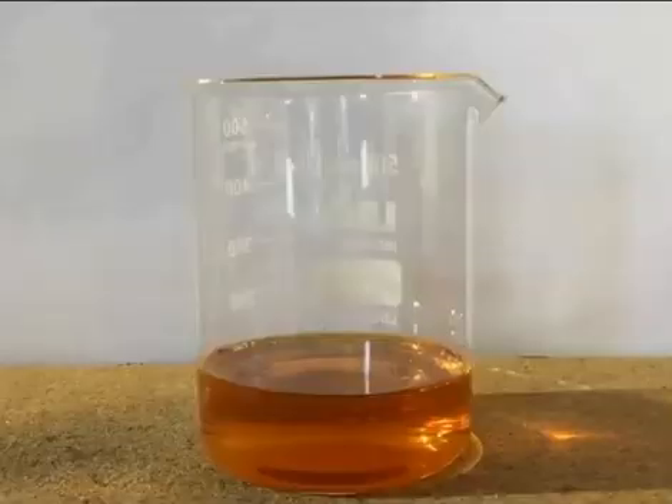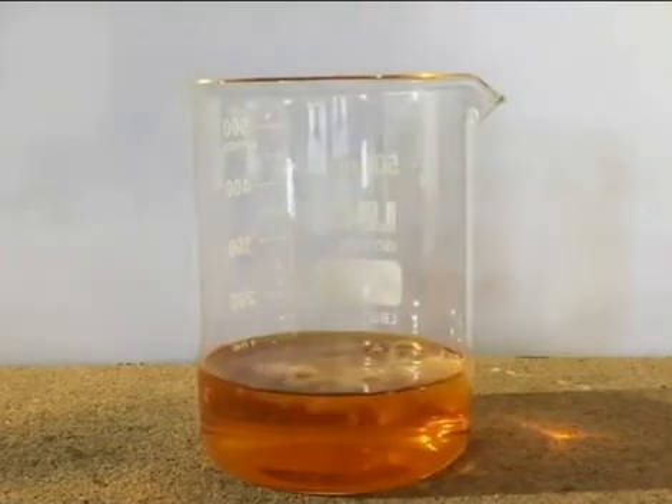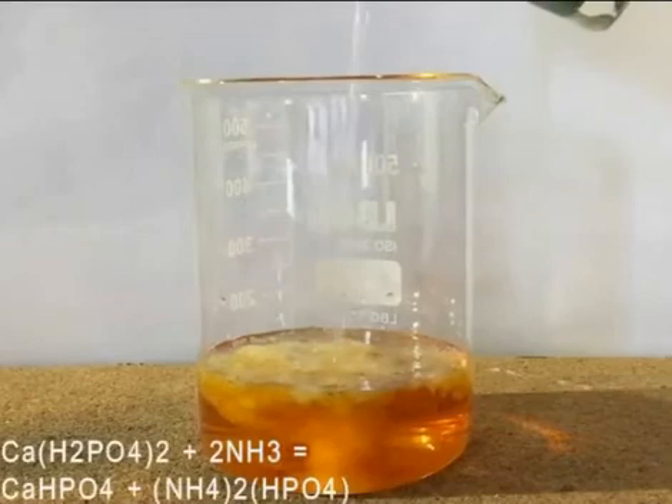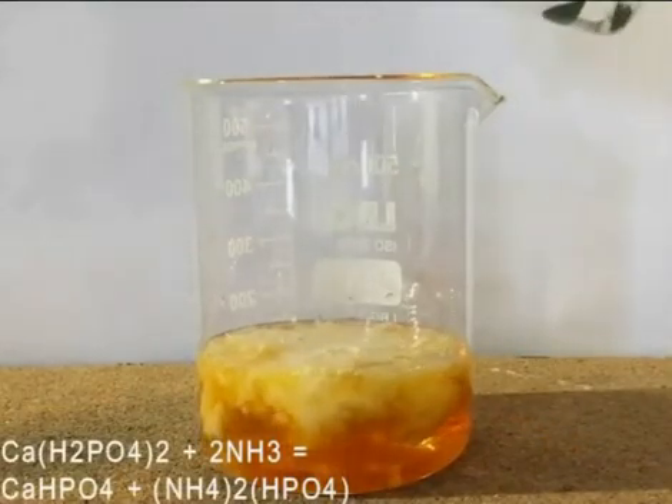The solution is transferred to a larger beaker and an excess of 5% ammonia solution is added, and a precipitate is formed. In the first reaction taking place in this step, the ammonia is reacting with the calcium dihydrogen phosphate to produce diammonium hydrogen phosphate and insoluble dicalcium phosphate.